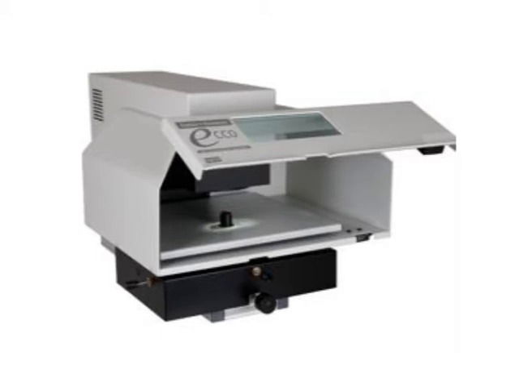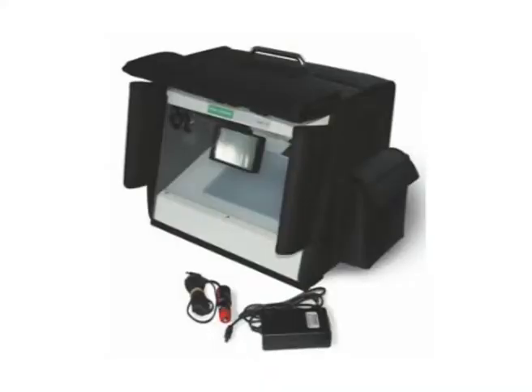Equipment. VSC has a box shaped main unit. A high resolution camera is placed on the main unit. The camera has sensitivity approximately from 350 to 1000 nm. This unit is also associated with a set of filters, different light sources and transmitted light panels. The light source is placed underneath the panel which illuminates the document. A 30 inch screen is attached to the main unit. A Windows based PC system is also associated with the machine.